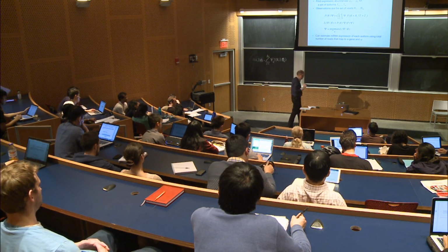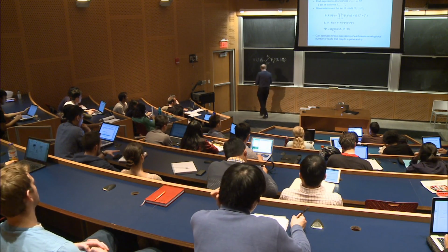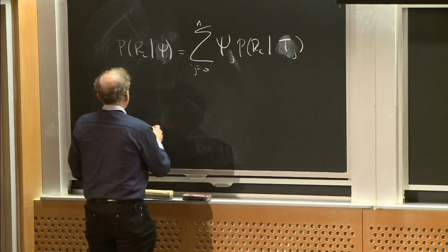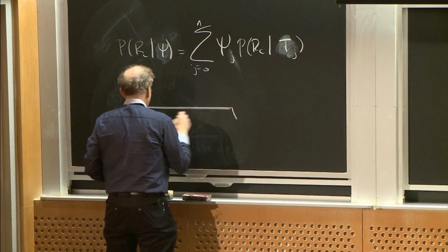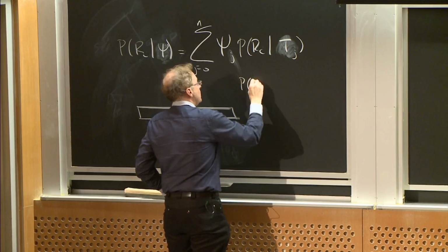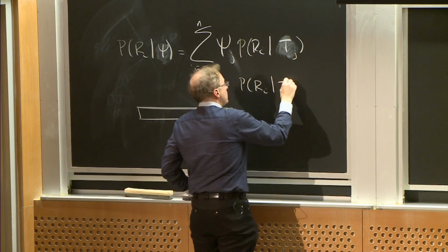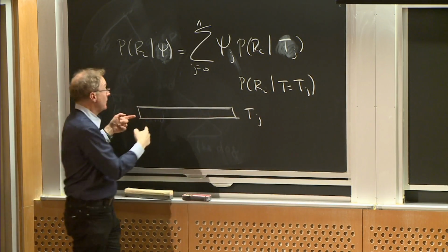Sure. The intuition behind that probability is that we're asking, so here is a transcript, and we're assuming what is the probability of a read given that it came from this transcript, okay?